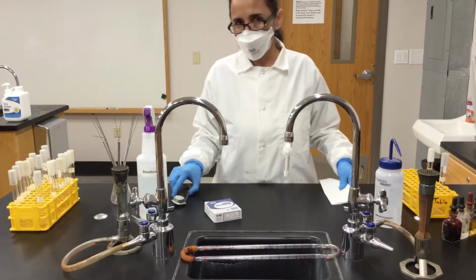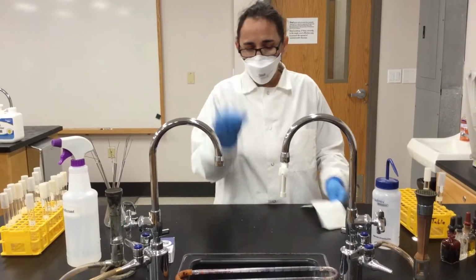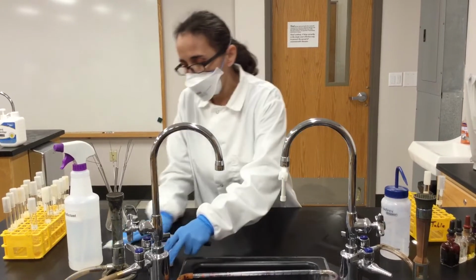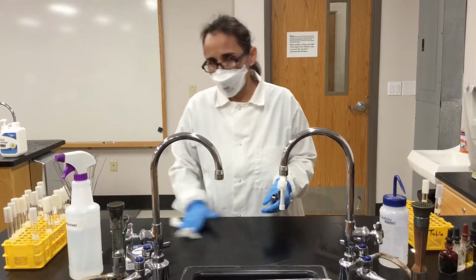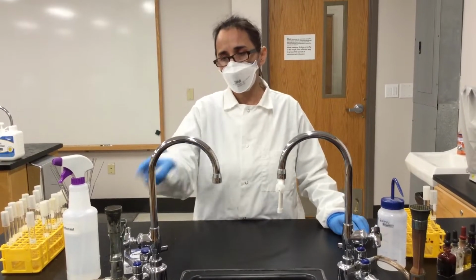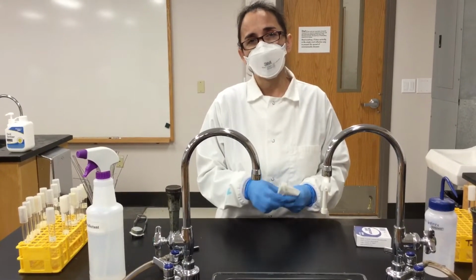And the first thing that we're going to learn is how to make a smear. So what is a smear? It's basically a thin film that you put on the surface of the glass slide, and that film is going to be a bacterial film so that you can work with your bacteria. Now, in the case of some stainings, you will be using bacteria that were fixed and killed with the heat from the Bunsen burner, but in other cases, you won't do that. In which case? Well, in the case of the negative stain.